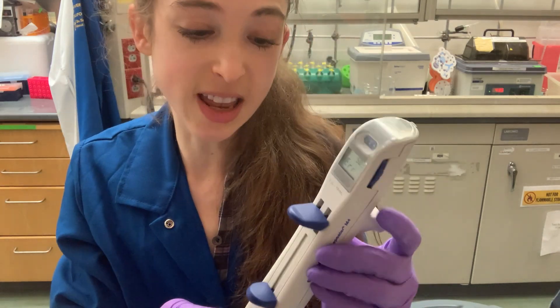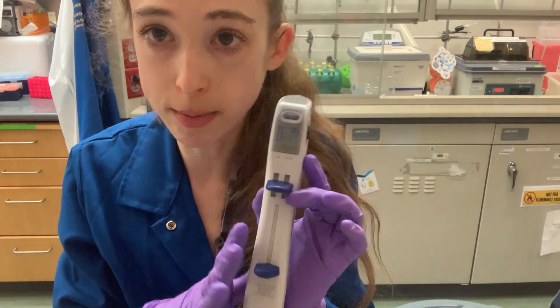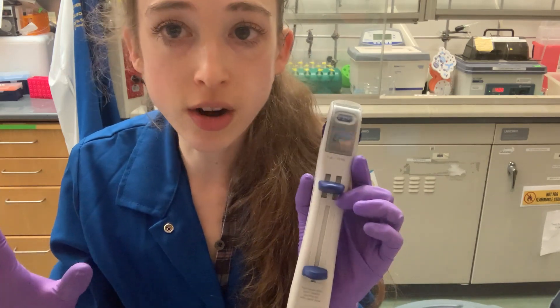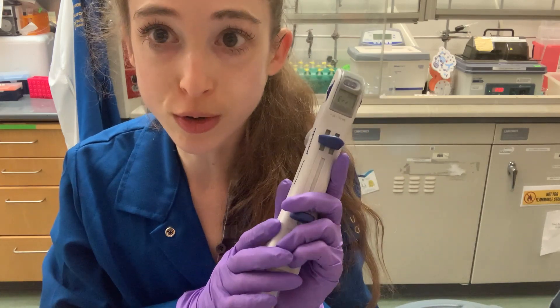I'm going to be using the Eppendorf Repeater M4 — I'm not endorsing this brand, it's just a really common one I've used in this lab and my past lab. There are also electronic ones that are more fancy, but this good old workhorse does the trick.